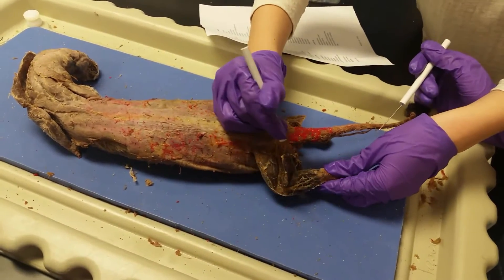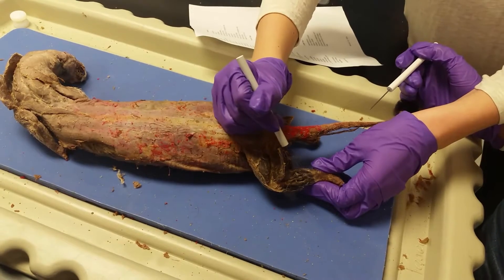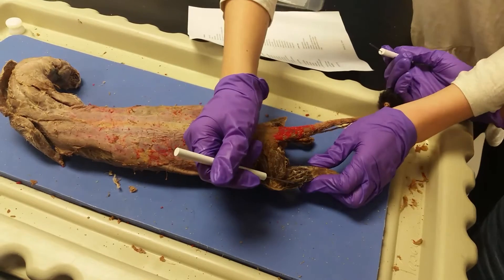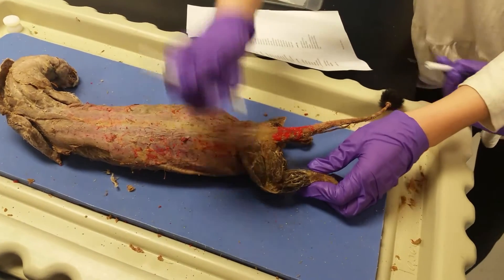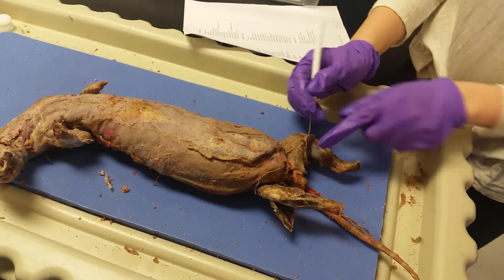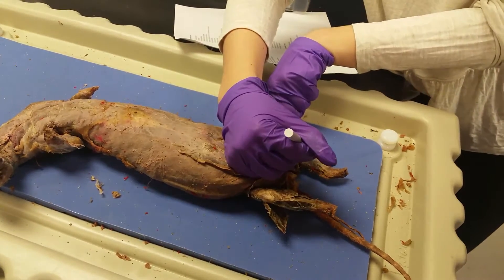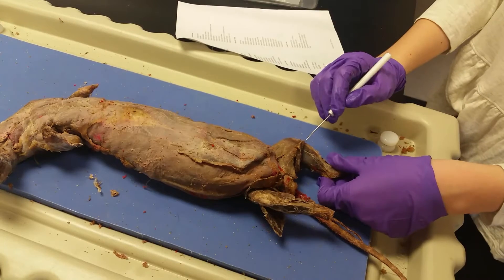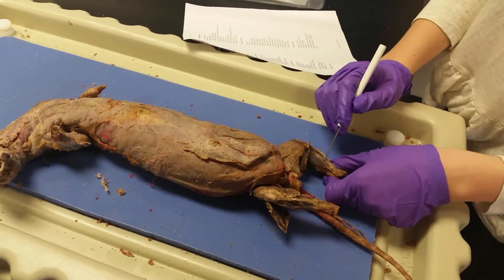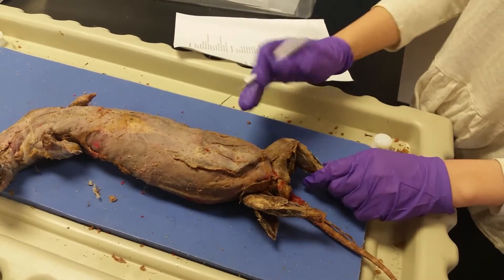Right here we have the gastrocnemius, which kind of wraps around to the other side. Right here is the peroneus. This one is the tibialis cranialis. And then if you flip to this side, you have the popliteus, and then you have the tibia itself, and then you have the flexor digitorum longus right here. And then this is the gastrocnemius, that's also on the other side.